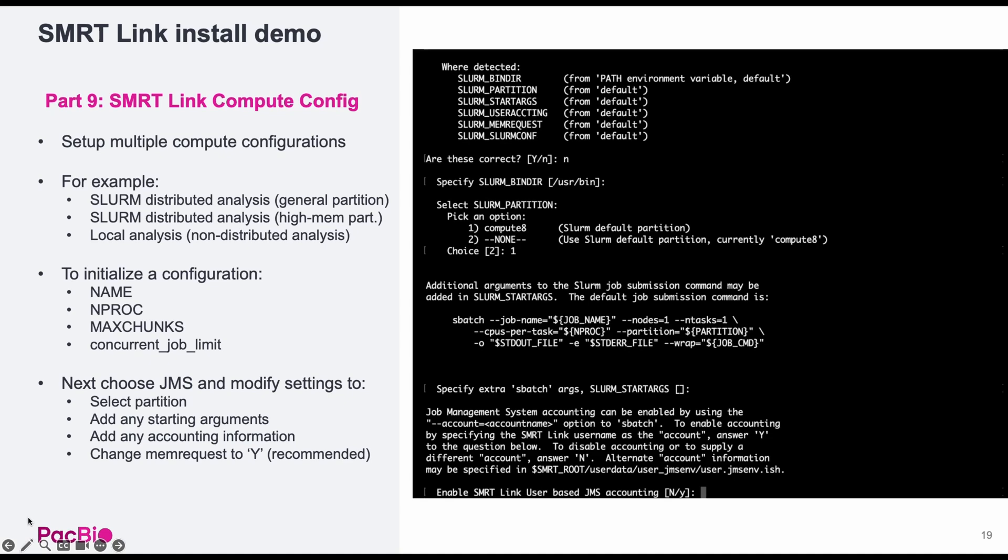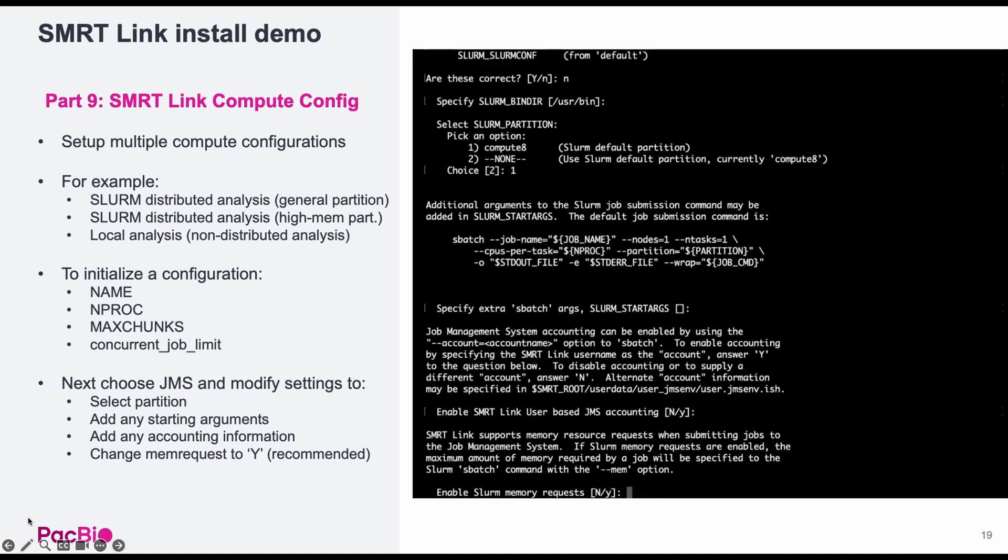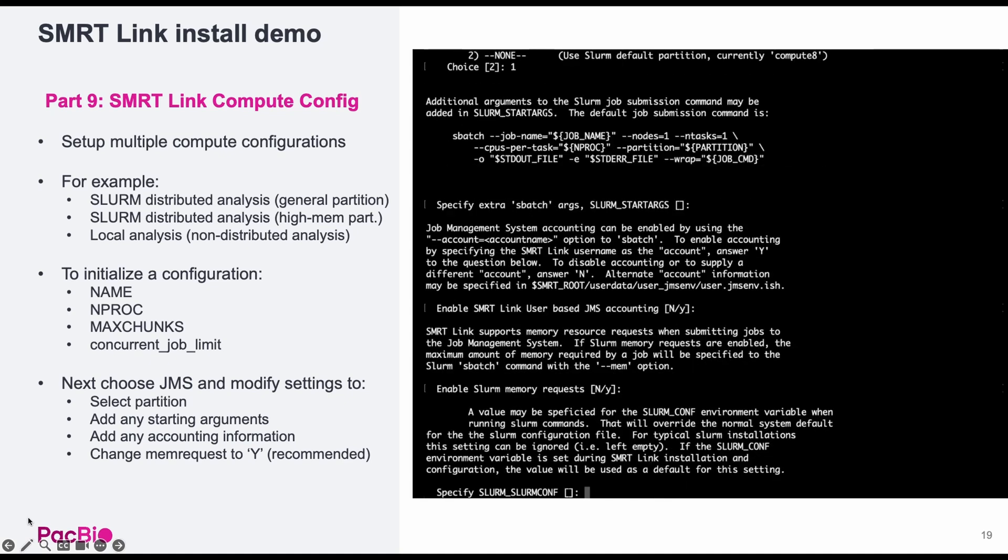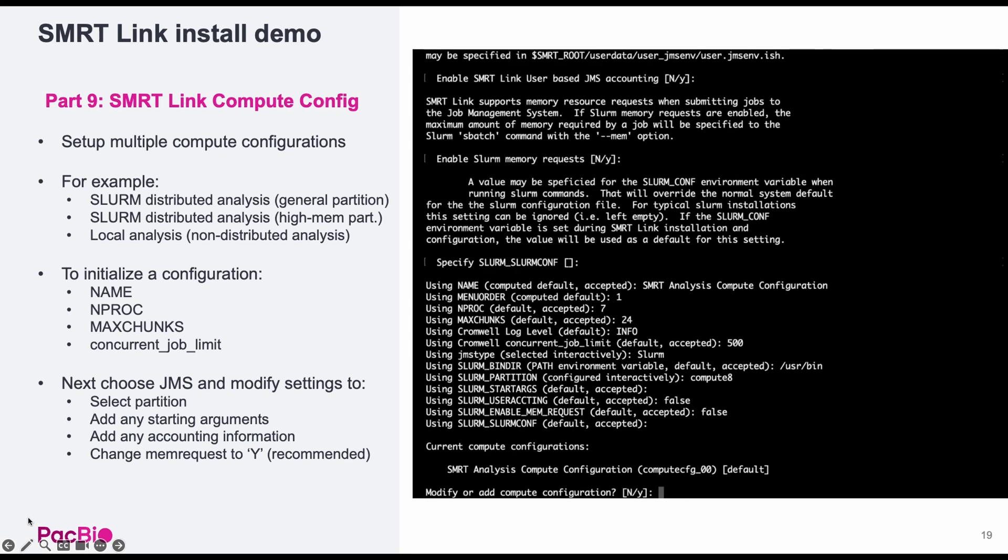You will be asked to confirm the partition you want to use, any additional arguments that need to be added to SBatch commands, any account associated with job submissions, and finally, whether SBatch should request memory for a given workflow, which again, I recommend changing to yes.